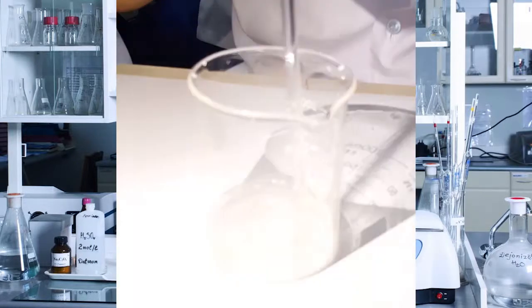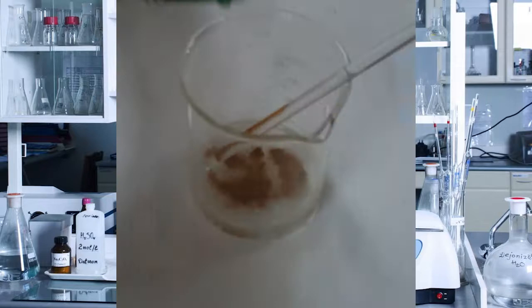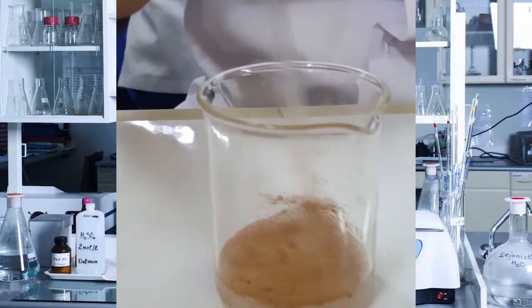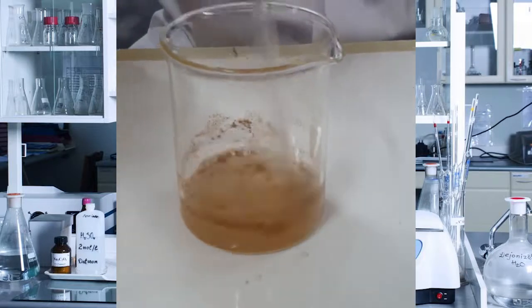The substances we use in the experiment are salt, water, and cinnamon powder. We mix the substances together in a beaker with the help of a stirring rod.